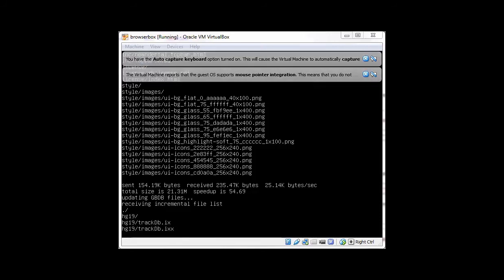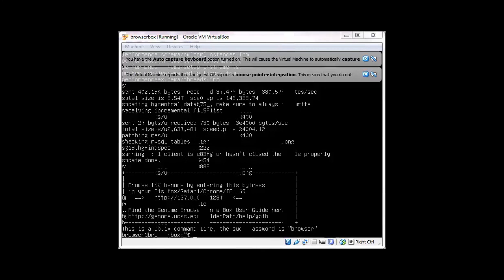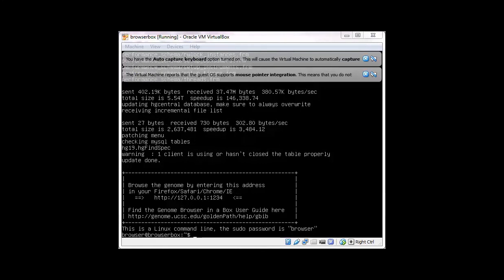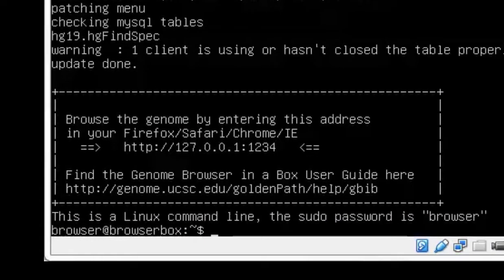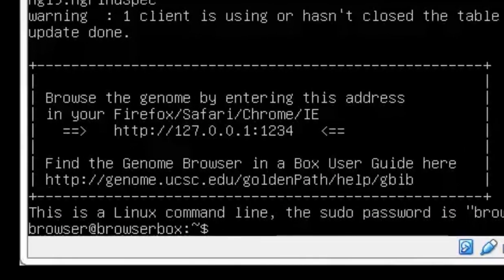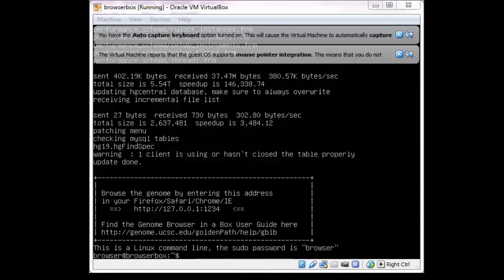Wait through this loading process until the command at the bottom tells you it's ready to go. After the VirtualBox has completed its setup, you will see a box near the bottom that says 'Browse the genome by entering this address in your browser,' and it gives the address HTTP 127.0.0.1:1234. So your BrowserBox is now ready — take this URL to a browser and you will be accessing the Genome Browser in a Box on your machine.